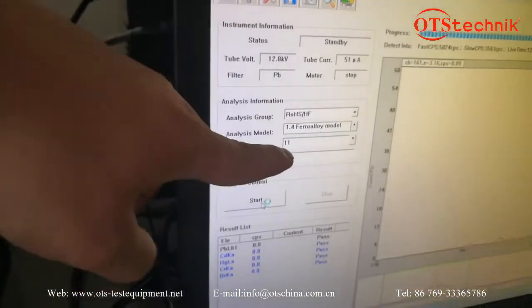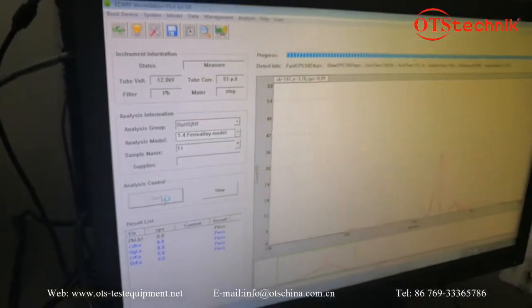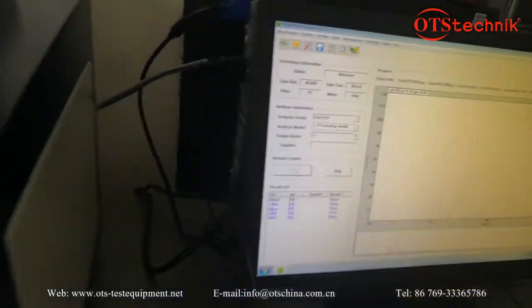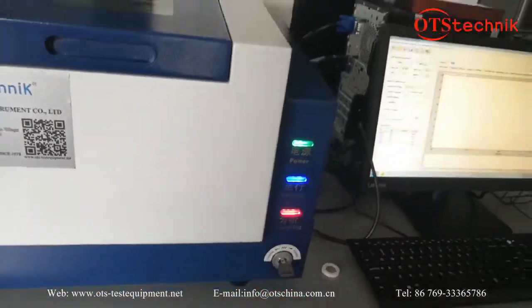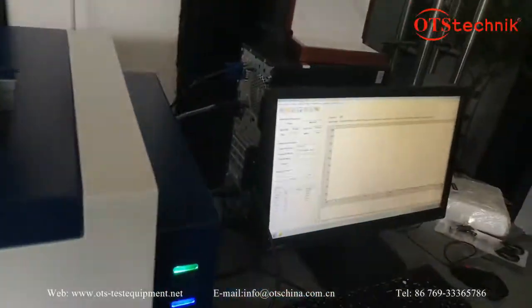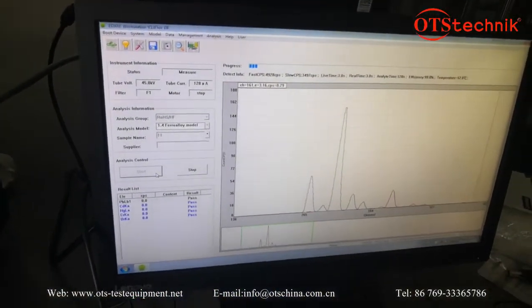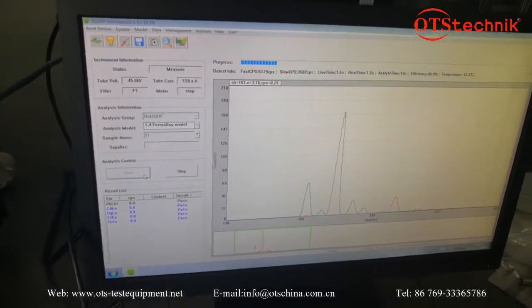For the test pattern, we set double round. We have set the time to only 10 seconds — just for a trial test. Now it's starting.